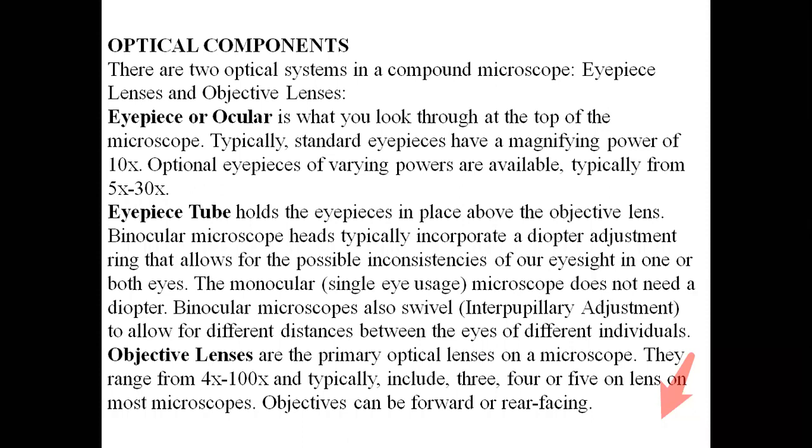So your eyepiece. Generally microscopes are supplied with a basic type of eyepiece, and the magnification for those eyepieces will be either 5x or generally 10x. Whenever we purchase the instrument, it can be supplied with the 5x also, and in addition to 5x, we can get 10x also.